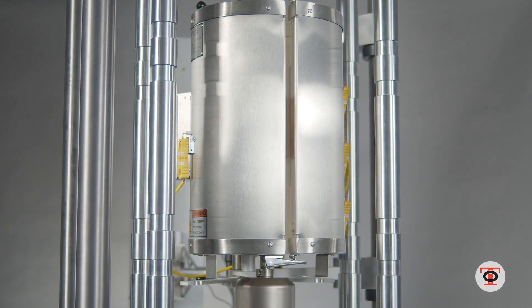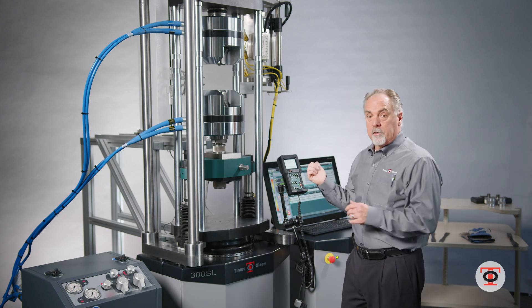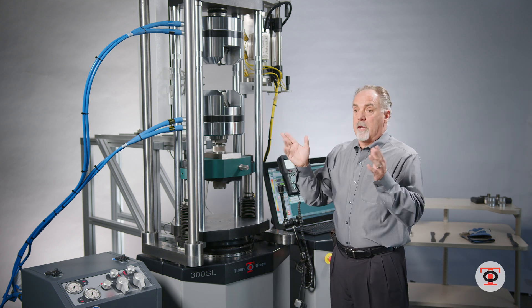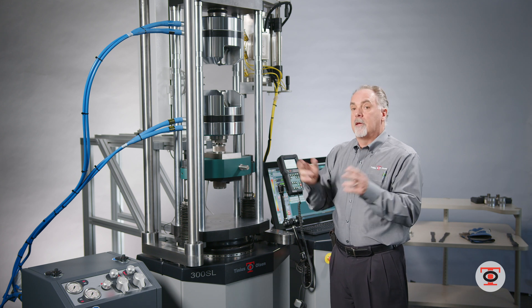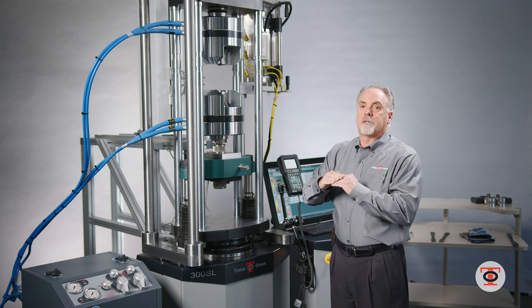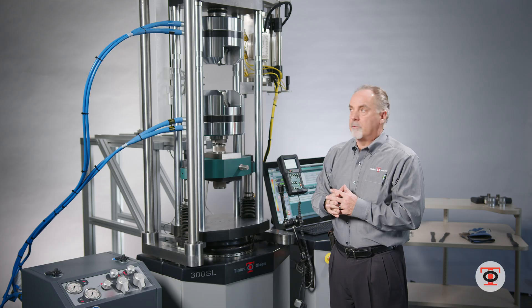This will have a furnace. This particular model also has an automatic extensometer which will set the gauge length based on the parameters in the software. You run the test, it clamps on automatically, and when the test is over it opens up. You remove your specimen, it resets the gauge length, and you put your next specimen in — ideal for high-production lab use.